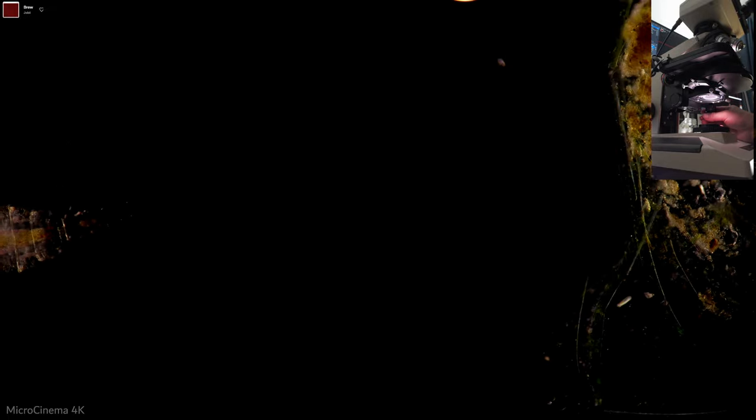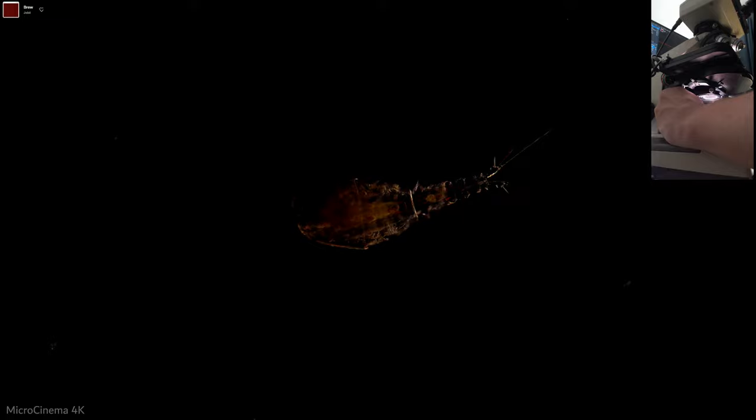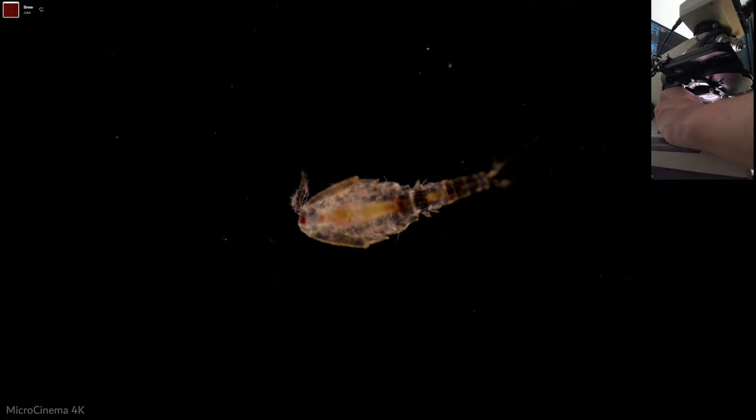And you can just barely see there's a little bit of light, but it's dark in the middle. And that just means we need to raise our condenser up. And so actually anytime that you have dark field that's dark in the middle, usually it just means you need to raise your condenser up. Now what I do is I kind of bring it up until I kiss the slide and then I drop it down a little bit.